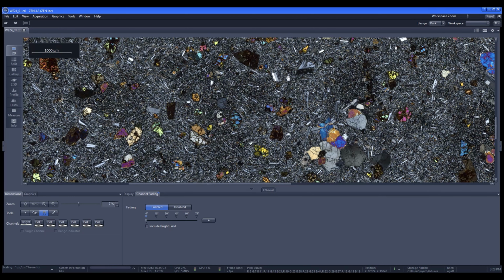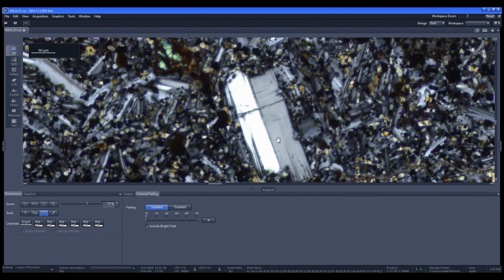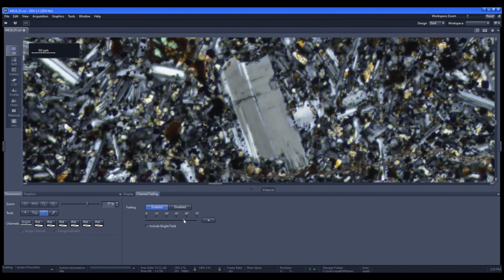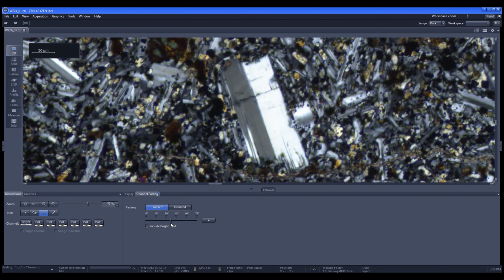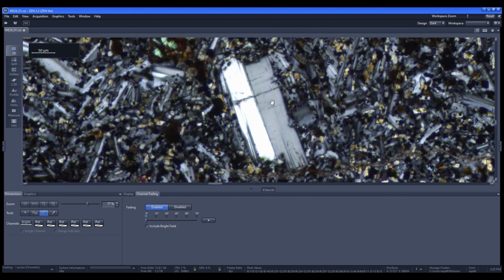If I was to use this specific chart, and again, it would be easier on a microscope, it all comes down to the angle. You see the striping here. Those are not cleavage lines. Feldspar does have cleavage, but those stripings are twinning. This specific twinning is really common in plagioclase. That's actually what you use to identify it as plagioclase. It's known as polysynthetic twinning.